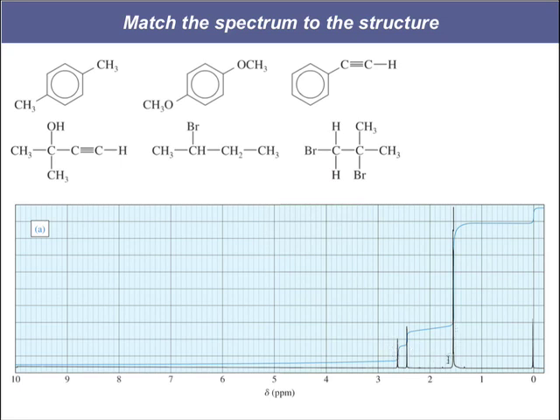Then we've got this lower peak that's at 1.5. Now remember that methyls should be 0.9, but these methyls are on a carbon that has an oxygen. So this oxygen is deshielding these methyls just a little bit to pull it from 0.9 up to 1.5.